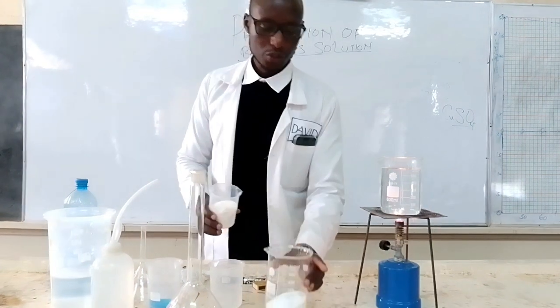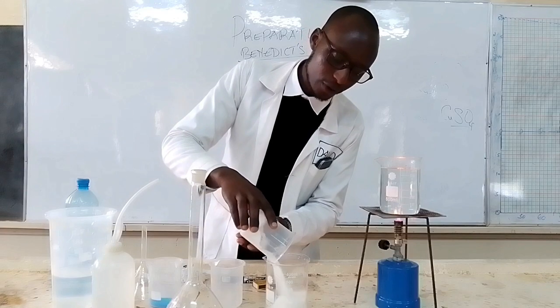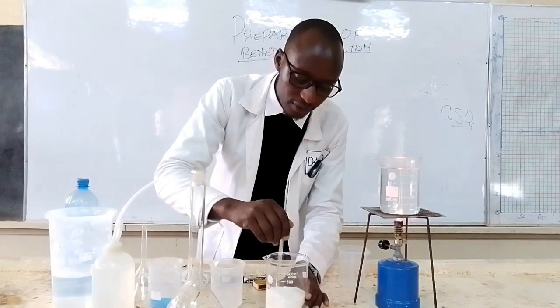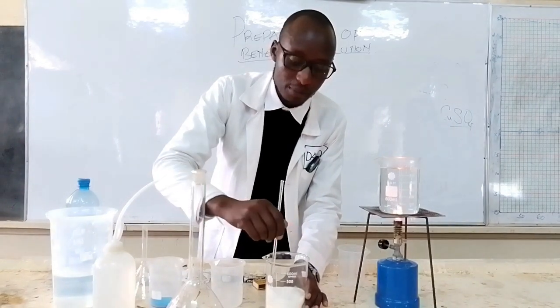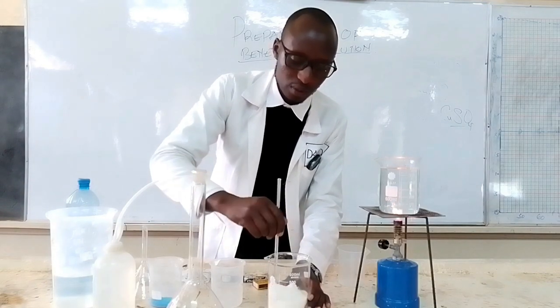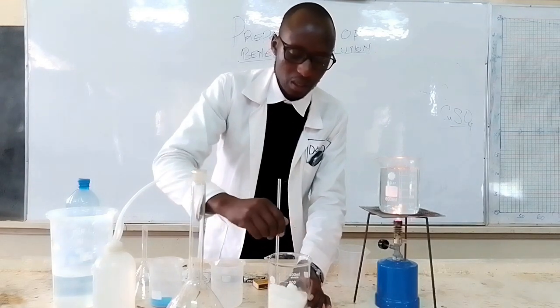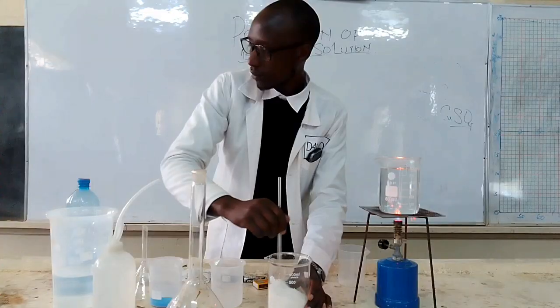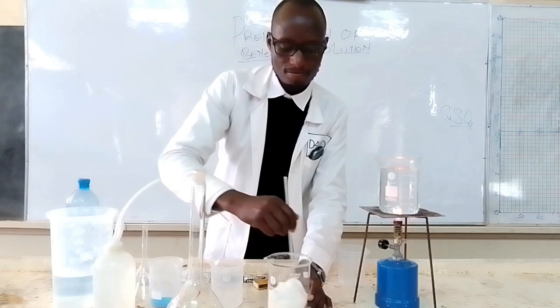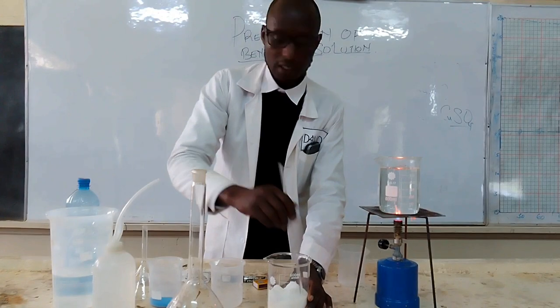That is my sodium carbonate. Then again I have sodium citrate. There we go, sodium citrate. Then I mix the two. Yes, I'm mixing the two, like that. That is it.